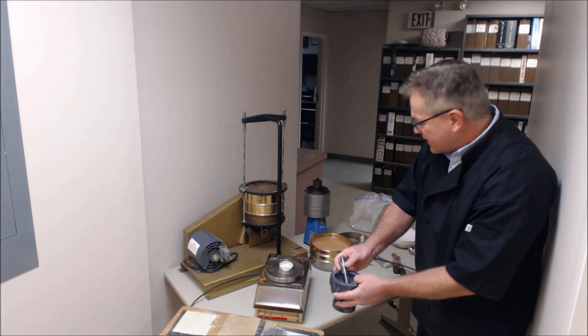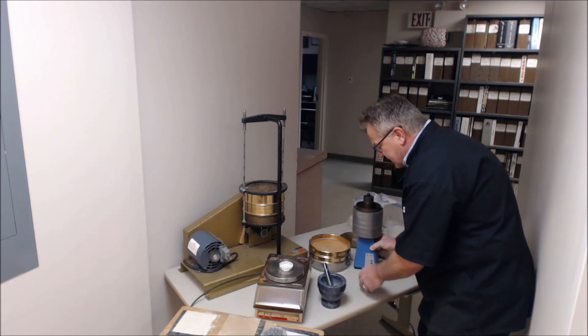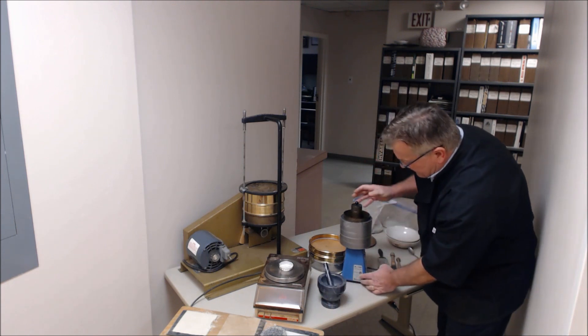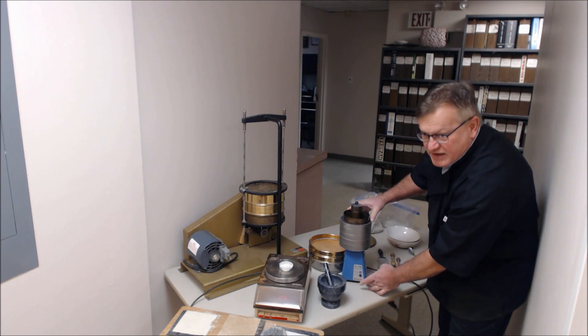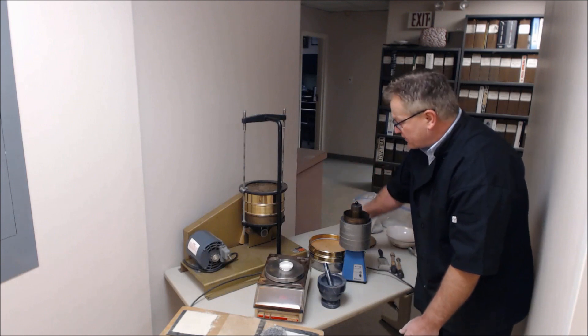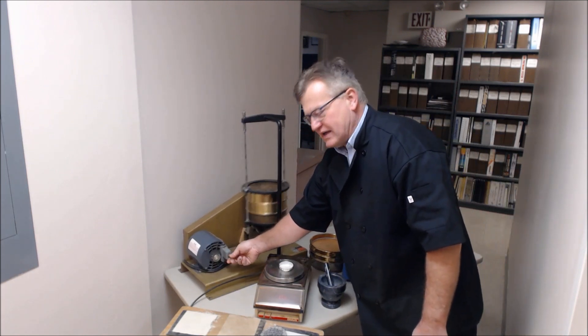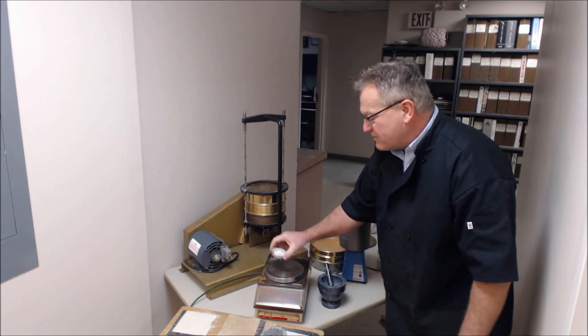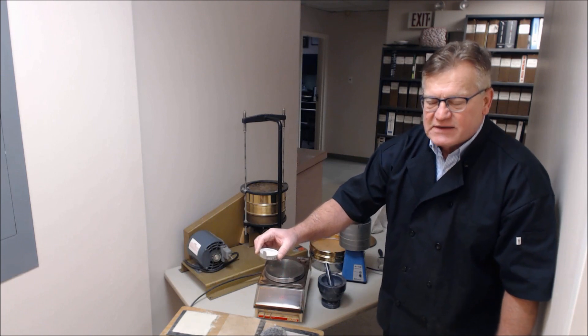This is the old school way to do it. The better way which is a lot easier is with a mill. You put the material in and then grind it. You then place it on a sieve stack and activate it to get the material for the two grams which is required for the swell index.